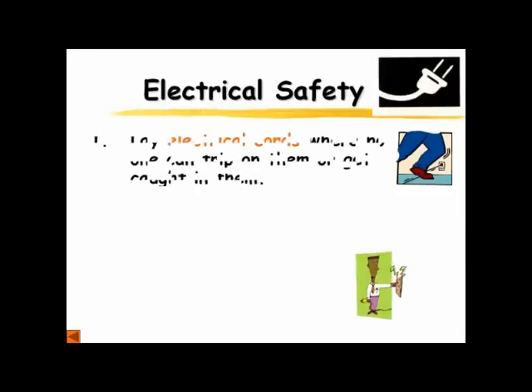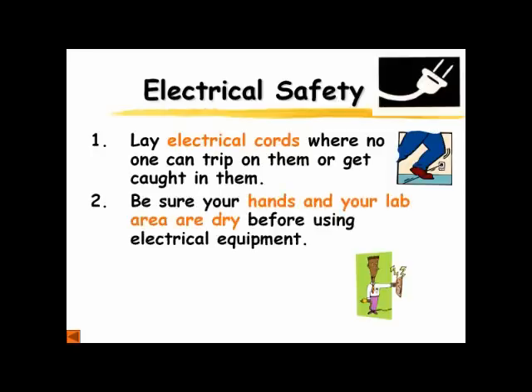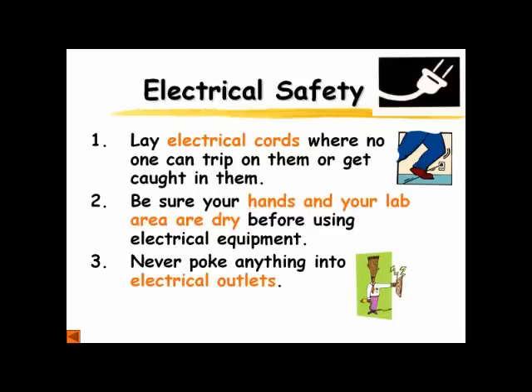Now, electrical safety. If you're using a hot plate or something that has a cord, you want to put the cord where no one can trip on it or get caught in it. Be careful about where the cords are. Be sure your hands and your lab area are dry before you use electrical equipment. You don't use the hairdryer in the bathtub. Same thing goes here. And obviously never stick anything into the electrical outlets.